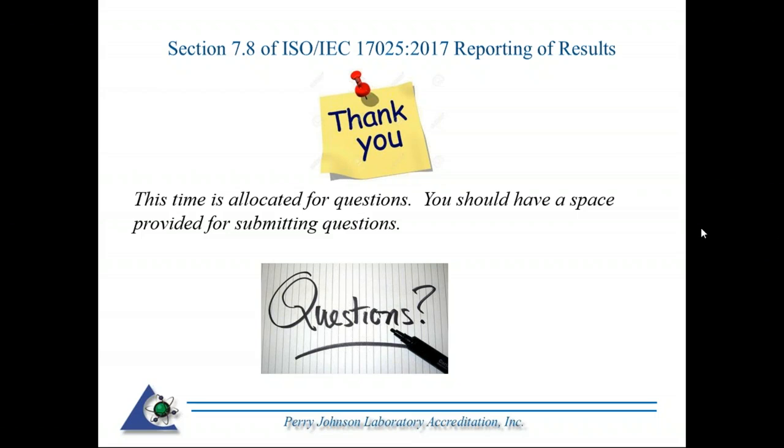If we have a barometer that we get calibrated every 2 years, do we need to verify in-house between calibrations? If so, how do we do that? Is an internal reference barometer needed? If so, do we calibrate the internal reference barometer? You get into the specific example and perhaps relate it to a specific test.